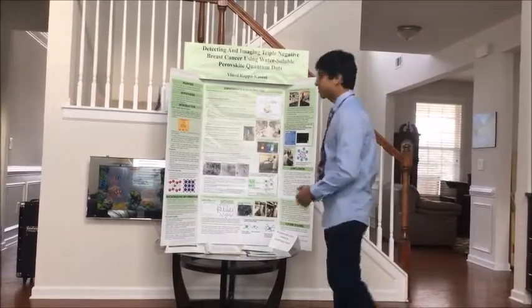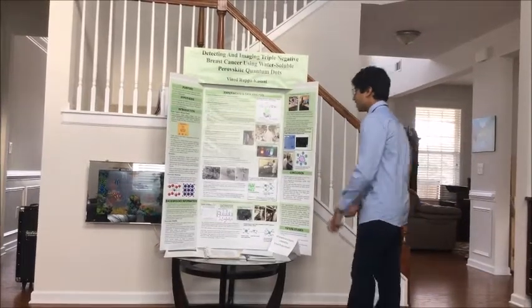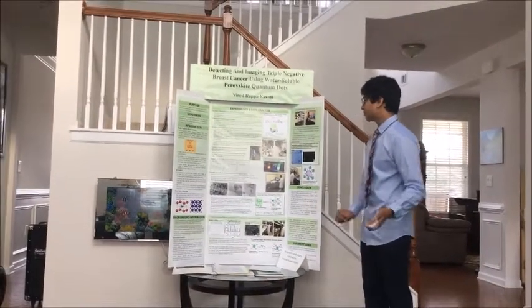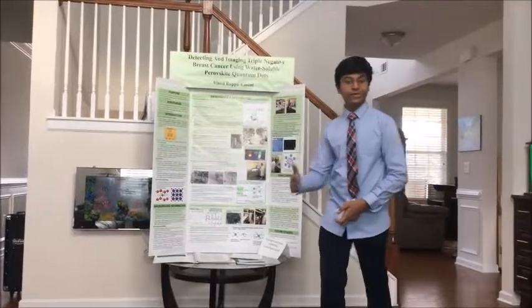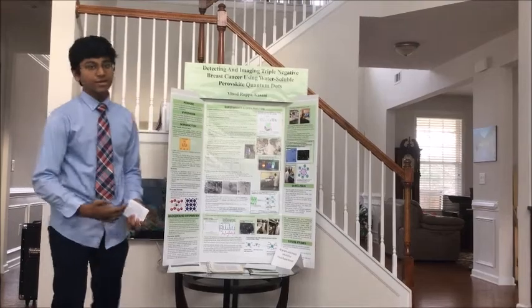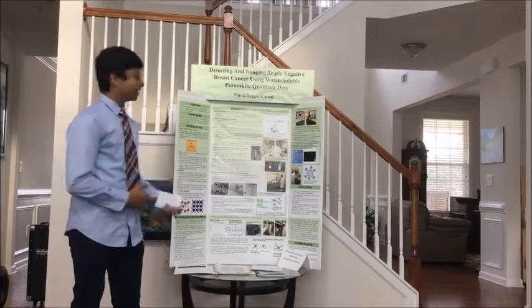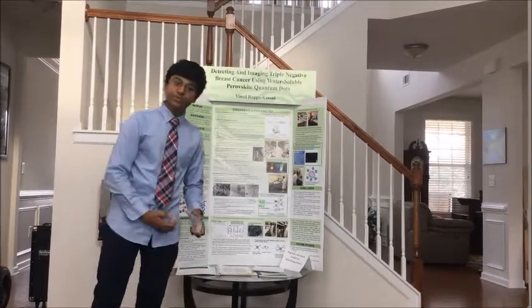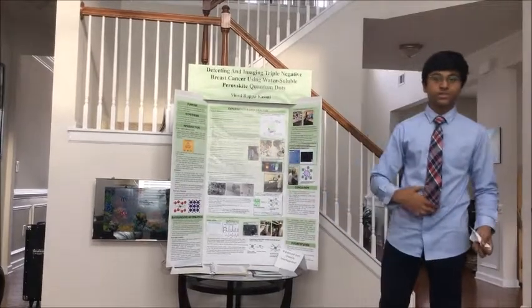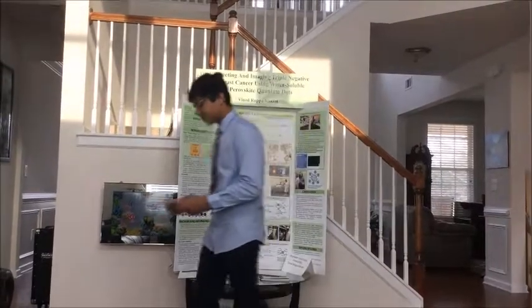So now I'll be getting into the results of my synthesis and the results of my experiment. Here you can see the fluorescence emission spectra of all my perovskite quantum dots, and you can see how the lambda max wavelength obviously matches the actual color of the perovskite quantum dots. For example, the green perovskite quantum dots had a lambda max wavelength of 516 nanometers, which is good for a green material, because green on the EM spectrum is around 516 nanometers, which shows that the synthesis is actually successful.